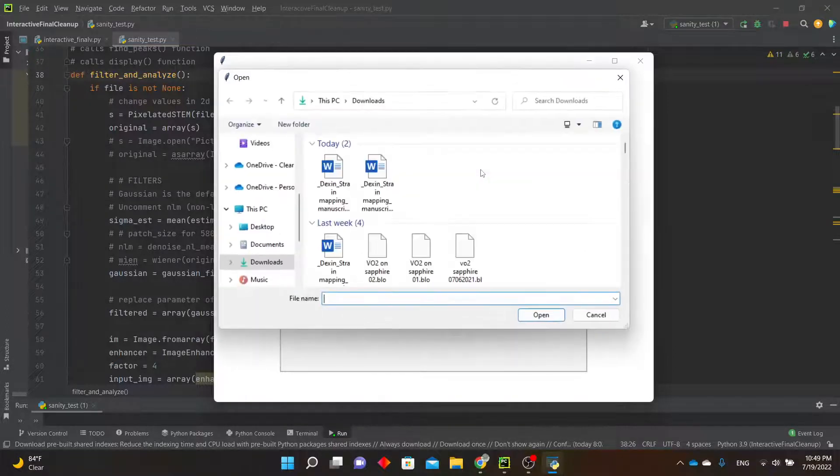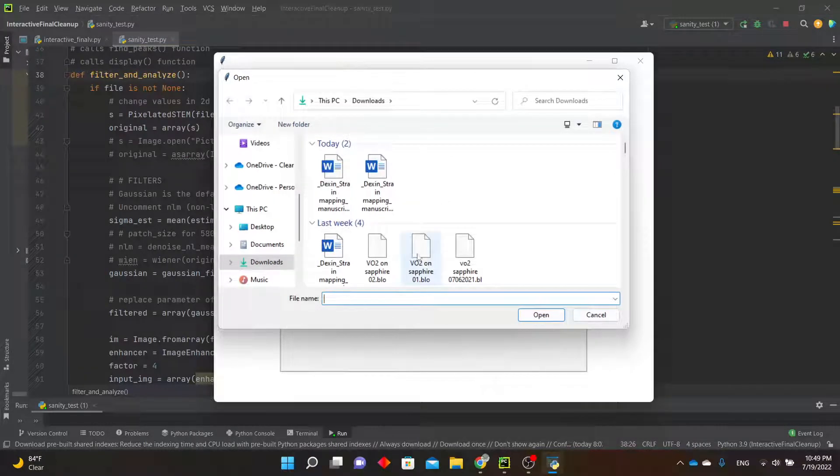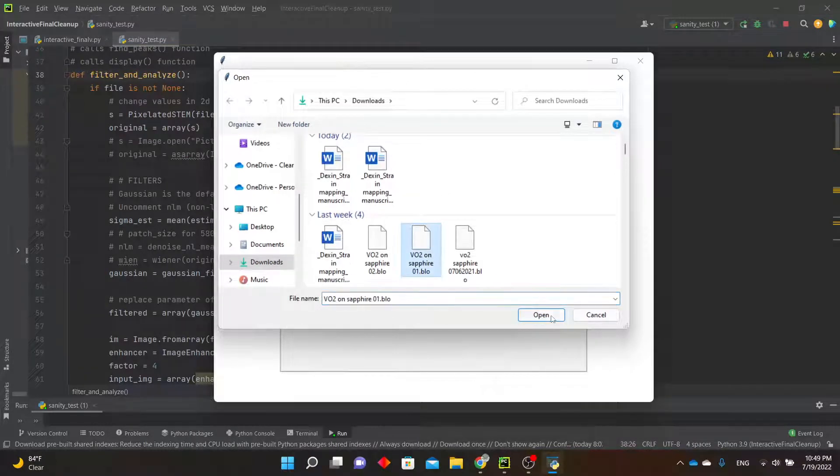First, click the Load File button, which will open your file explorer, and select the block file that you would load into the main program.